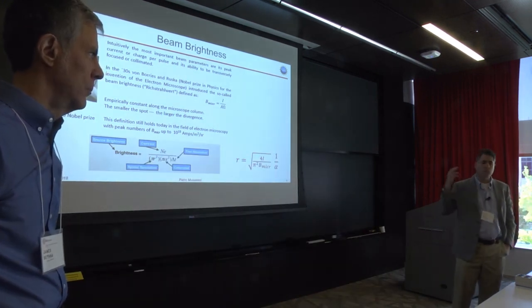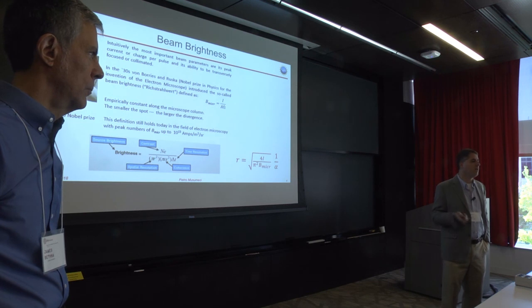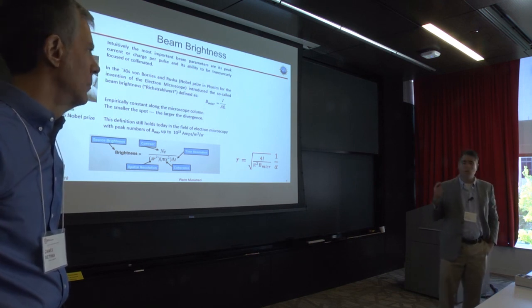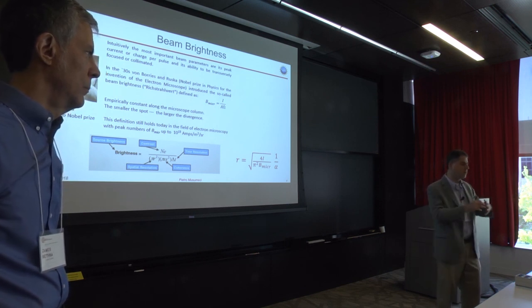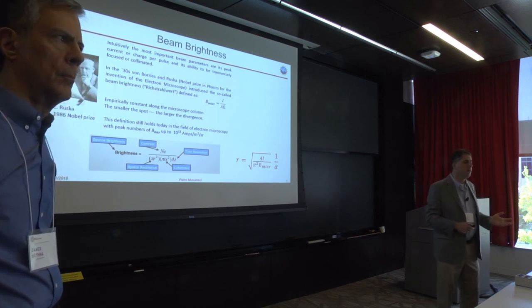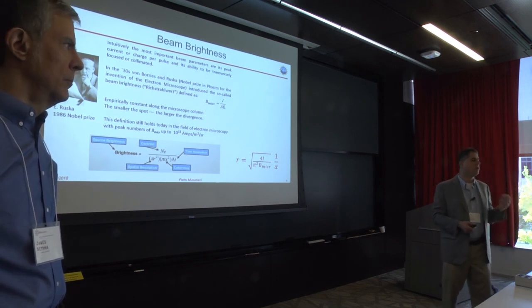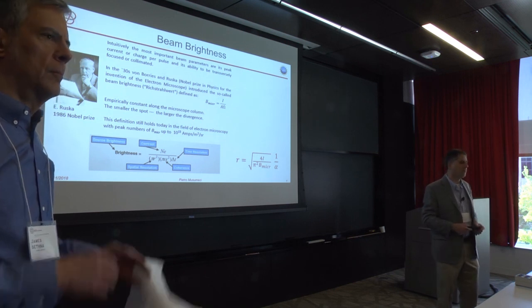So I can do electron microscopy with 1 electron per pulse. If I try to put more than 1 electron per pulse and make it a femtosecond pulse, the 2 electrons are going to scatter against each other. That's the huge problem for ultrafast systems: the management of what happens to electrons in a bunch when I put more than one electron in it. It blows up on you very, very quickly. Nanometer, nanosecond is kind of the number to think about. So going for atomic resolution in a system with more than one electron per bunch is extremely difficult.